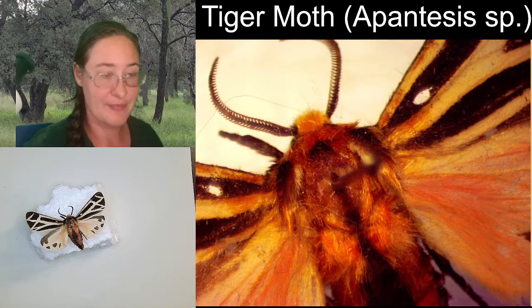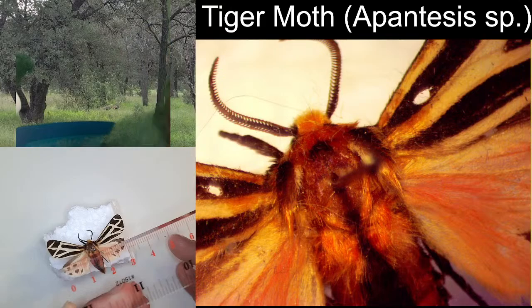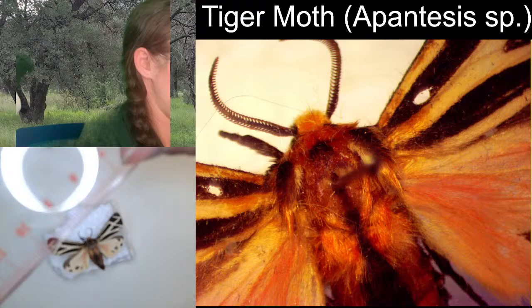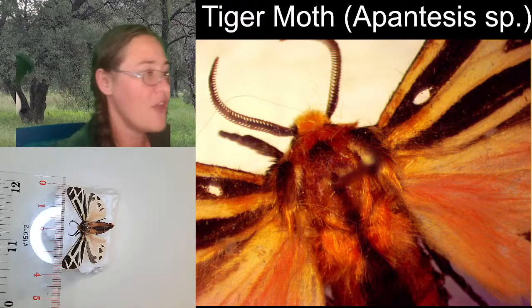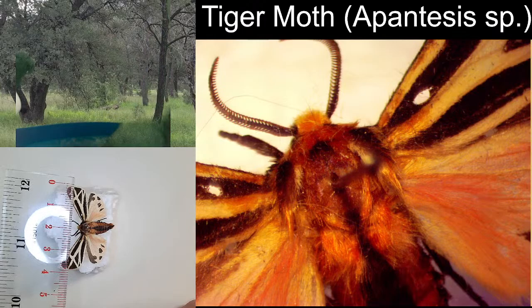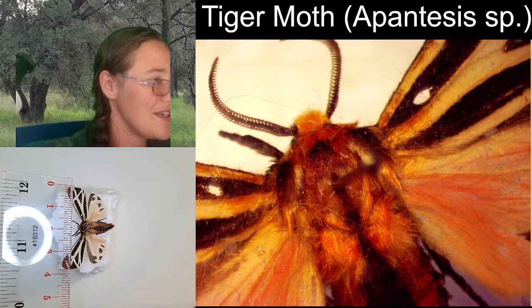I'm going to pull out a ruler and get us some measurements on the wings. I have a clear ruler today, so this should be fun. Here we go. We're going to do it like this. If we were looking at and measuring the wingspan of this moth here, that's funny, it's pretty much exactly 4 centimeters. Almost to the dot.